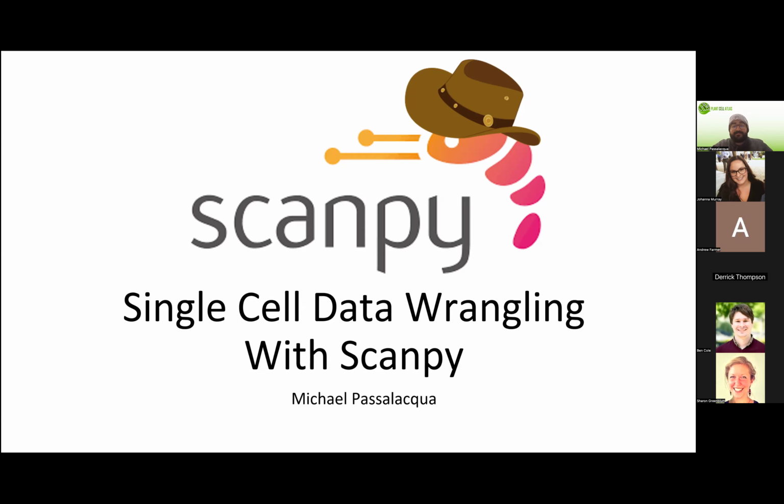And hopefully by the end of this lecture, you'll be at least familiar with ScanPy. You'll be familiar with what you can do with single cell data, and you'll avoid some common errors that people make when they're analyzing single cell data for the first time.